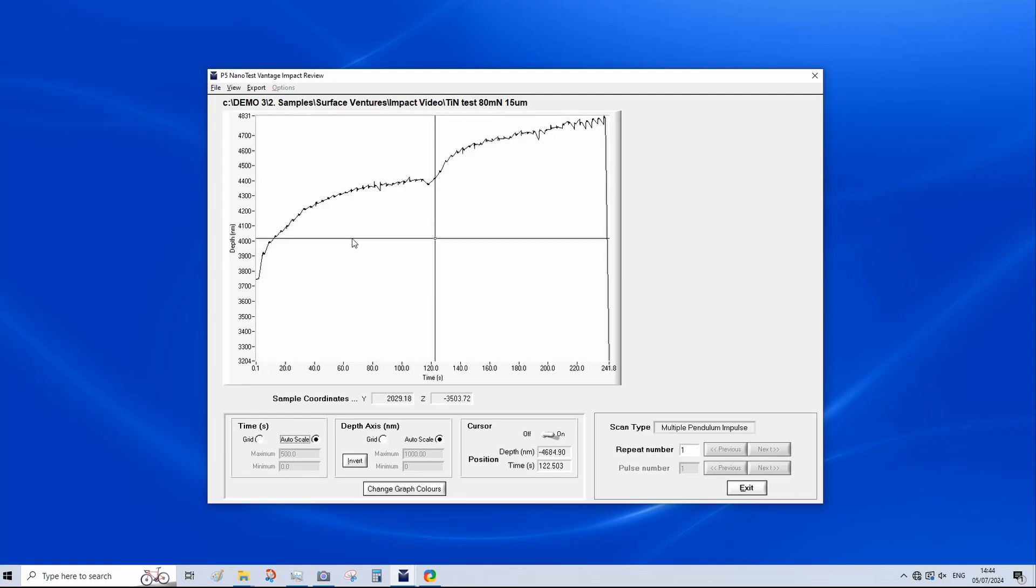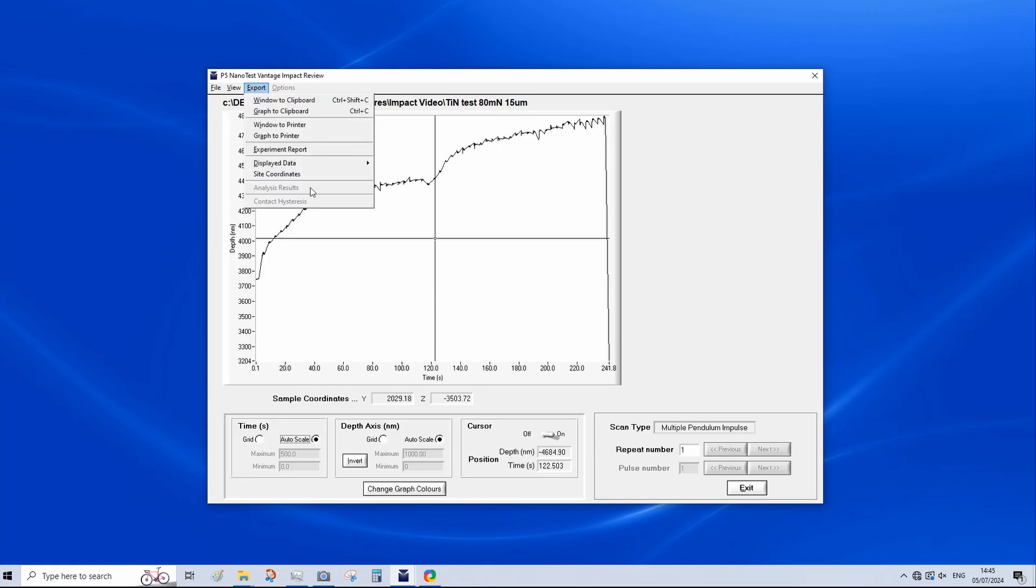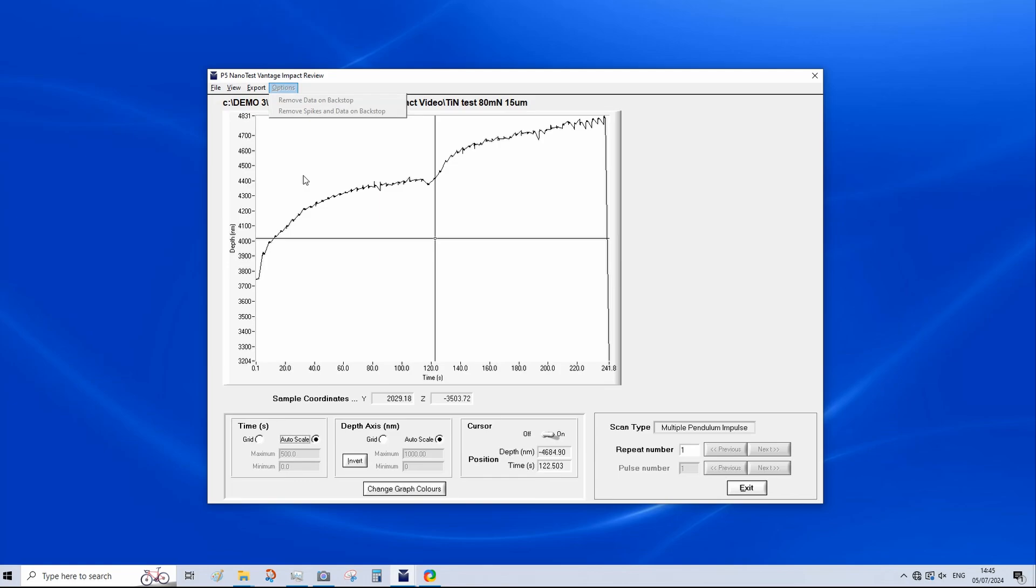When the indenter impacts a sample, there's the primary impact, but also the succession of smaller impacts as energy is lost from the system. Removing spikes will smooth out these smaller impacts out of the data. We can have a look through the depth time of each impact. Depth of time data can be exported. Here, various options. And this is available in standard formats such as tab separated text files to allow the user to plot the data in a program of their choice.